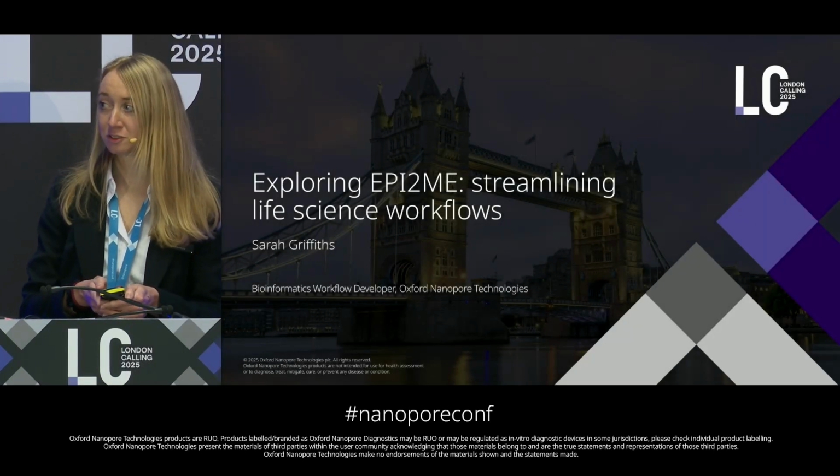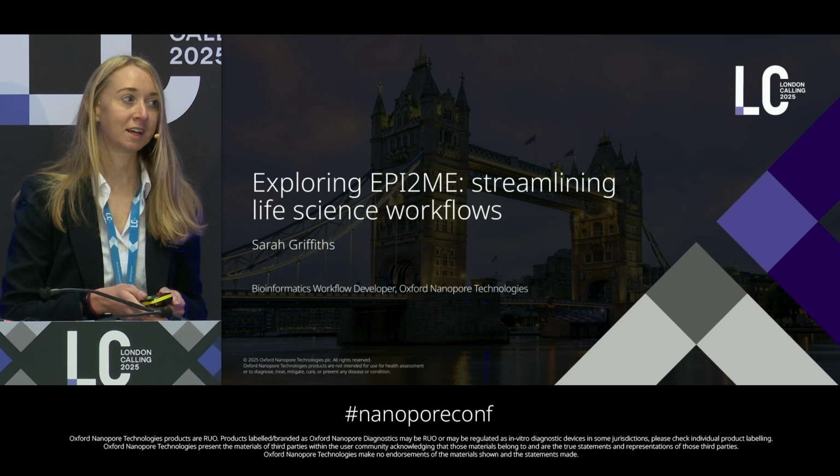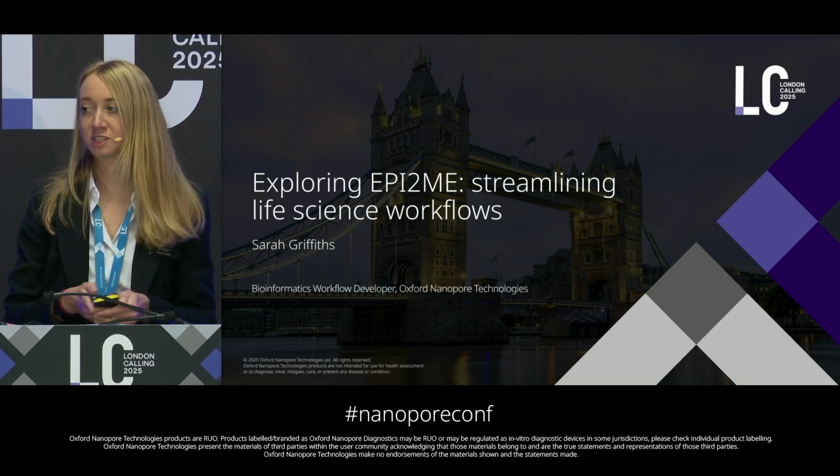Today I'm going to give a brief introduction to the latest EPI2ME platform and then show you how you can streamline your analysis using our sequencing workflows.